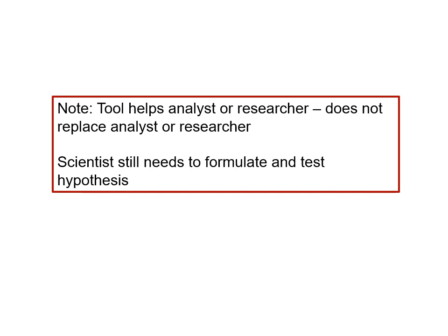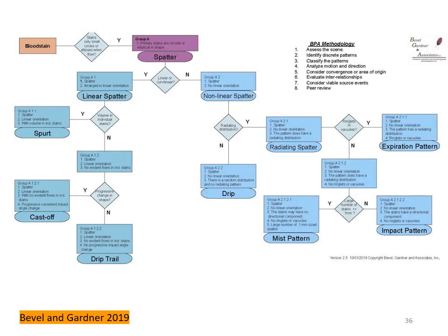You still need a scientific mind to formulate your hypothesis and to test them. It's just going to help you to test your hypothesis, and it's going to count the stains for you. So let's look at classification.